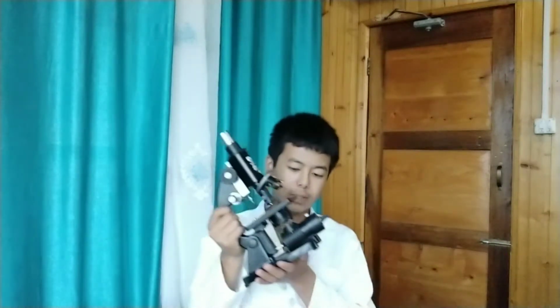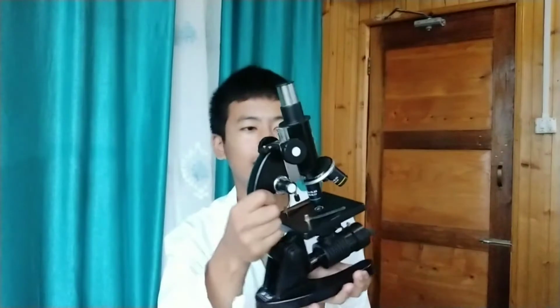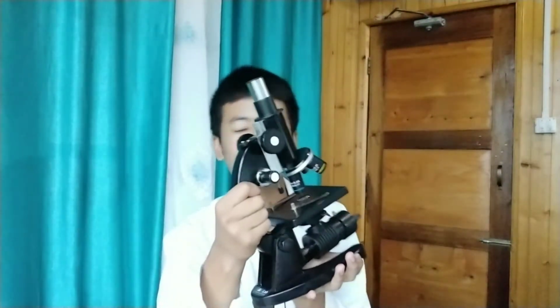So I use a G Lab microscope, which I ordered from Amazon. You can get it on Flipkart also. There are different kinds of compound microscope, and there are some binocular microscopes you can try. But I use a compound microscope, also known as a student microscope. This is a very good quality microscope. I just love my microscope. So let me keep it here.